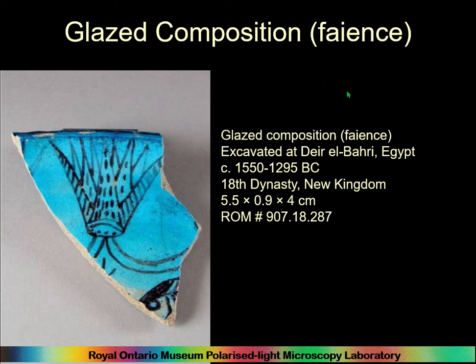Sometimes people call these things fritwares, or frit, which is also completely erroneous because it is not frit, and it doesn't include frit added to it. It includes glass and quartz. Frit is a process on the way to making a glass in certain circumstances where you fuse the glass materials, which things like alkalis and glass, fuse them together without it becoming molten.